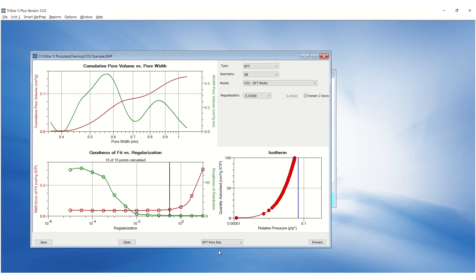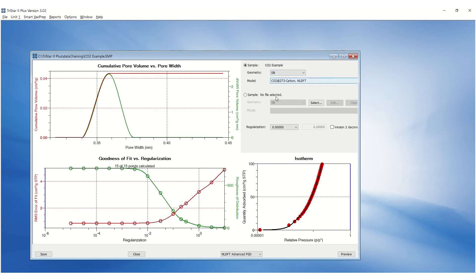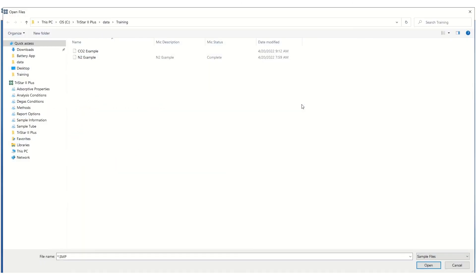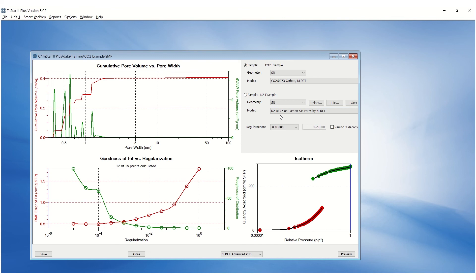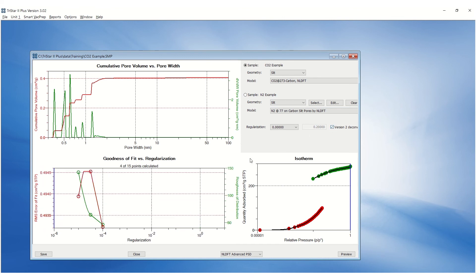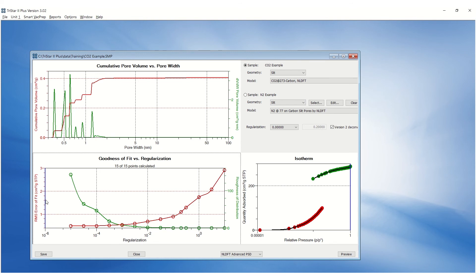If you have a nitrogen and CO2 isotherm on a carbon sample, go to NLDFT Advanced. Load the N2 file and select the model. Select the appropriate geometry and model. Select Version 2 Deconvolution to minimize the roughness. Adjust the regularization to minimize the error and roughness.